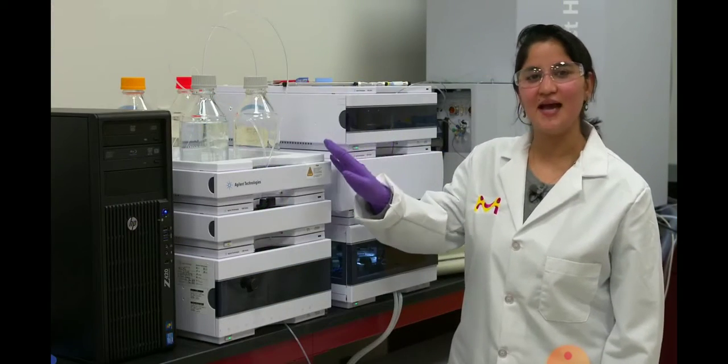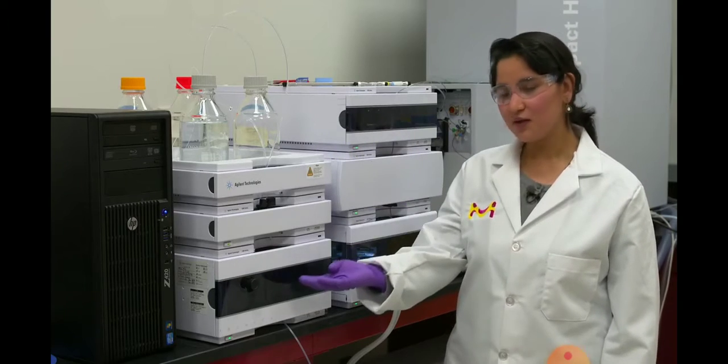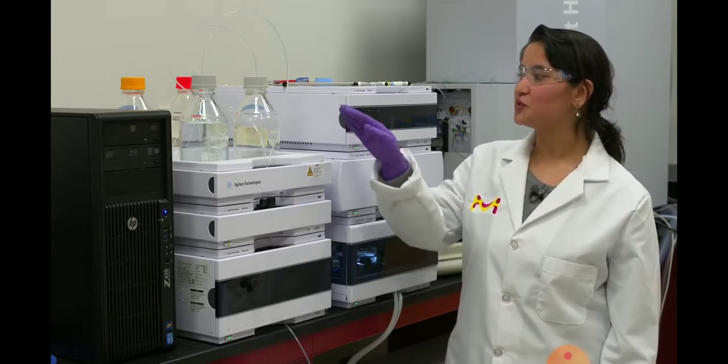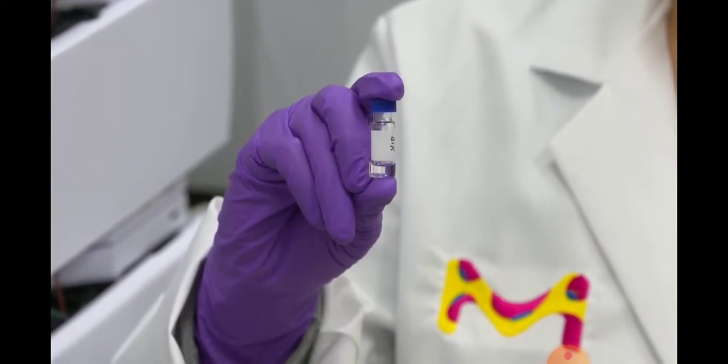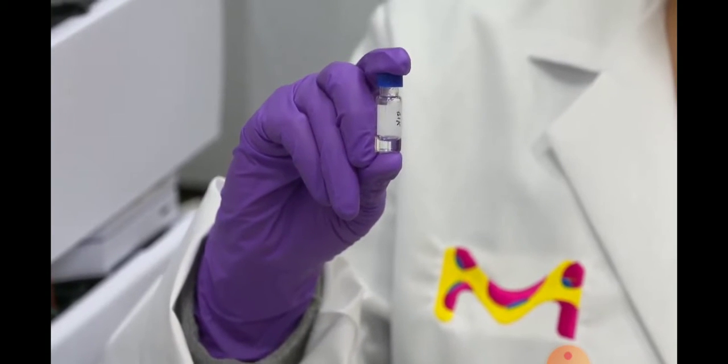Once your system is adequately primed, your column is in place, and you have chosen the proper mobile phases, your system is ready to be equilibrated. When running your standards, you want to make sure you run your standards in multiple injections. That will ensure repeatability. There are many different types of HPLC systems.